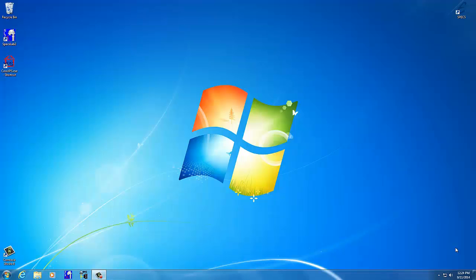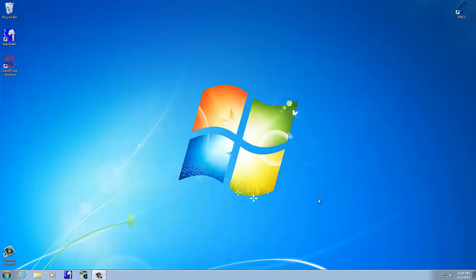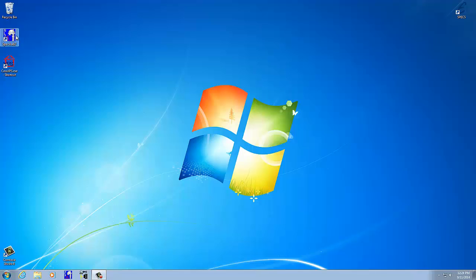This video will show how to take data on the XPS system. After logging onto the system and making sure the X-ray source is already up and running, select the SpexLab 2, assuming the analyzer power supply is on also.